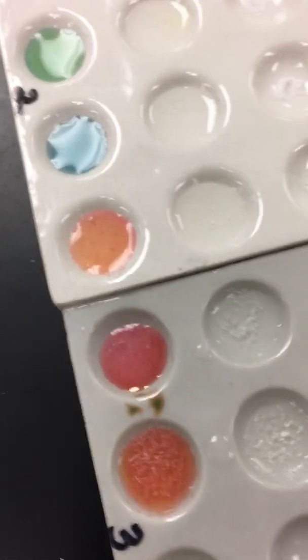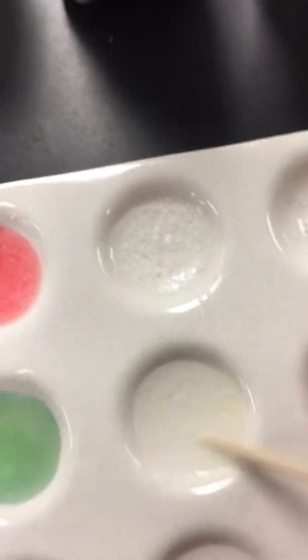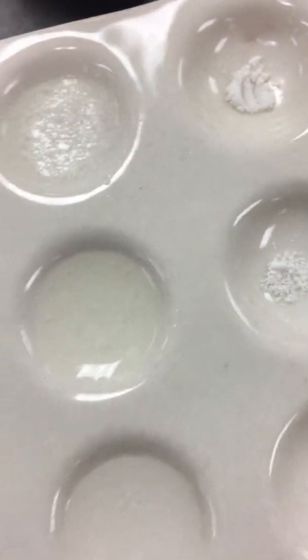So again, I'm going to get my toothpicks out. We'll start up here. And it really isn't dissolving. That's the aspirin. This is Alka-Seltzer, which looks like it dissolved pretty well. Maybe a few bubbles, kind of hard to tell.